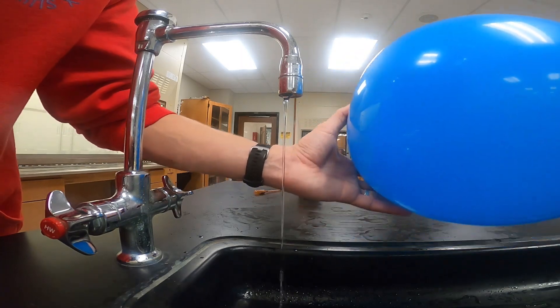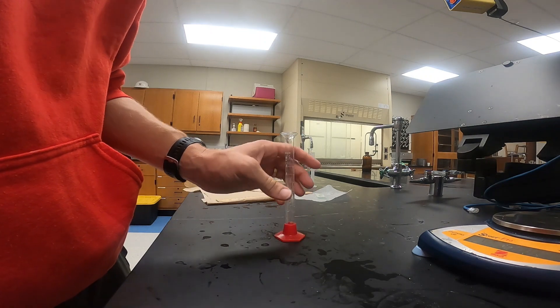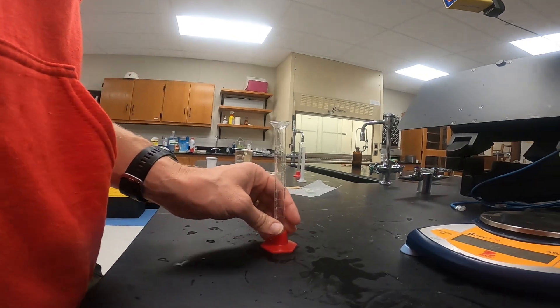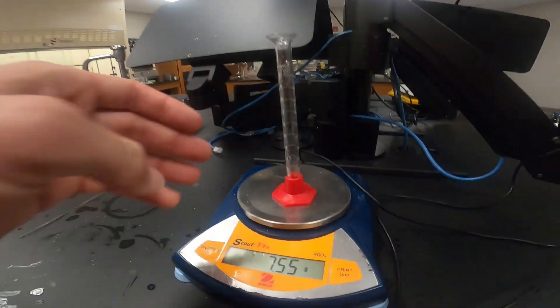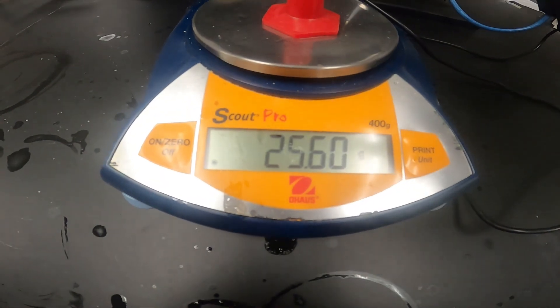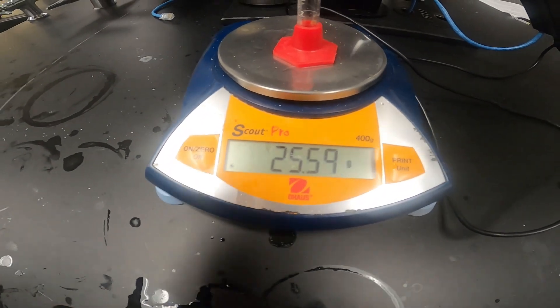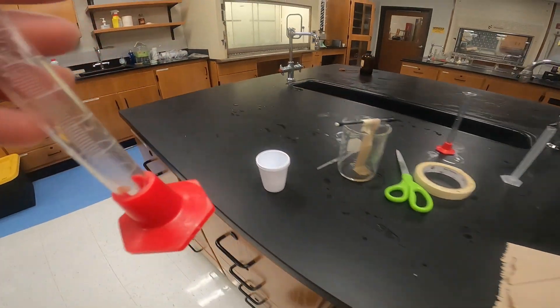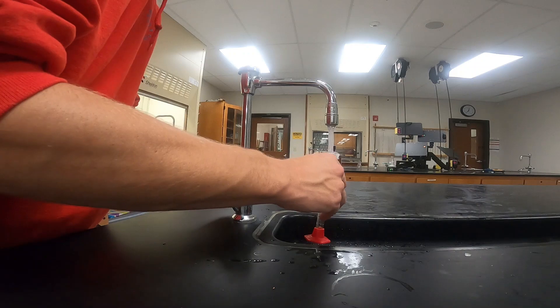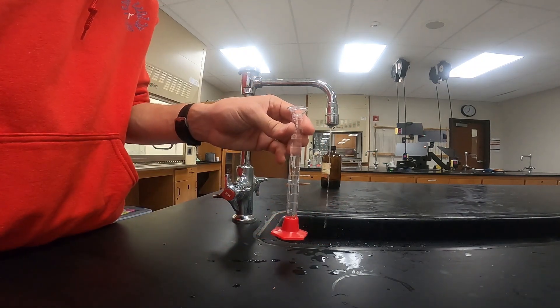For the next station, we're going to determine the density of liquid water. We start by weighing an empty graduated cylinder — we get a mass of 25.6 grams. We're going to add 10 milliliters of water to our graduated cylinder and try to make it exactly 10 milliliters, then weigh it again.